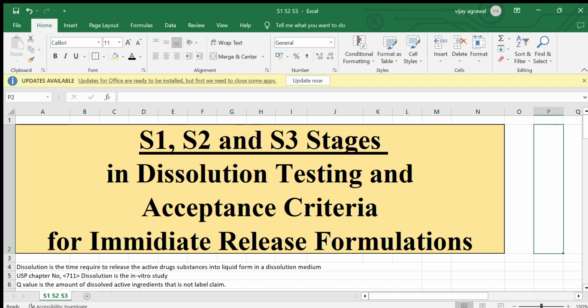Hello and welcome, dear professionals, students and learners, to another interesting topic on dissolution testing and acceptance criteria. This video will cover the S1, S2 and S3 stages and requirements as per the USP. The S1, S2 and S3 dissolution testing and acceptance criteria is for the immediate release type of formulations.